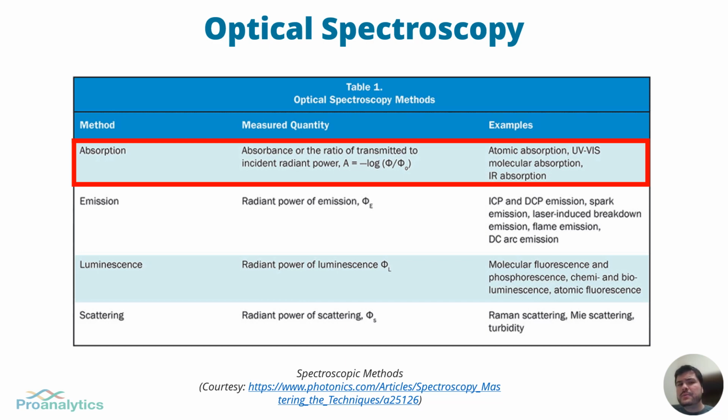Near-infrared spectroscopy measures combinations and overtones of molecular vibrations generated due to the change in the dipole moment of a molecule with covalent hydrogen bonds, such as CH, OH, and NH bonds.